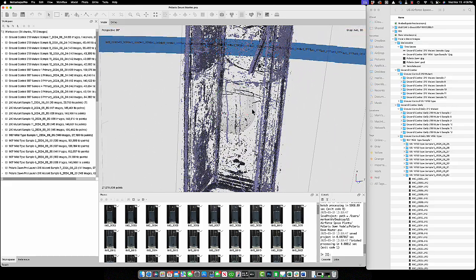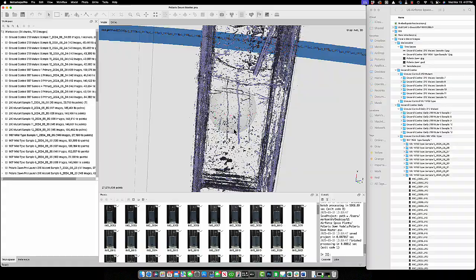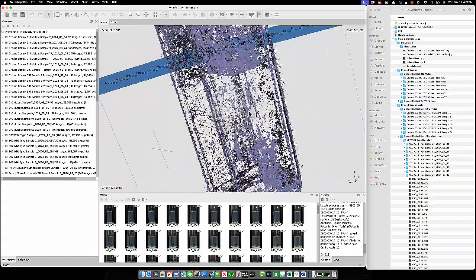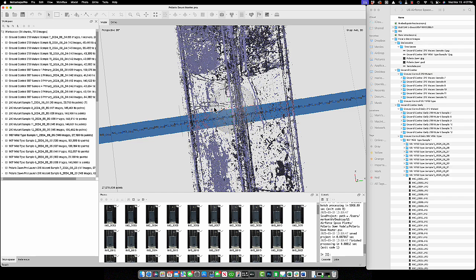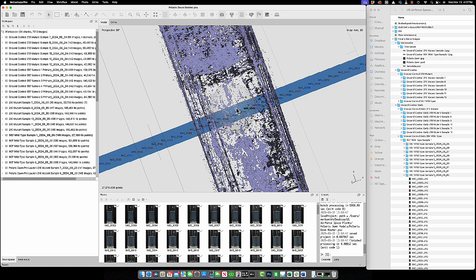So this is what I basically have every single time I have built a dense point cloud for these cuvettes. I have 4 representations of the exact same pathway that the root has taken through the agar, and that is simply because of refraction. As the lens is looking onward, right through the glass, as long as this face here is perpendicular to the viewing direction, then my root is in the perfect orientation.